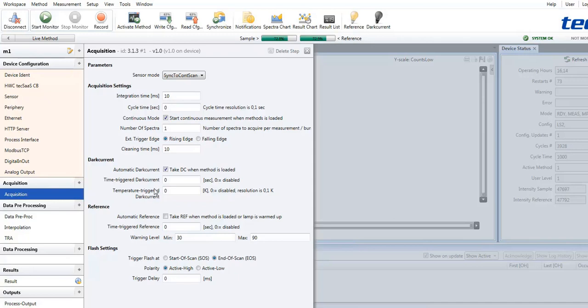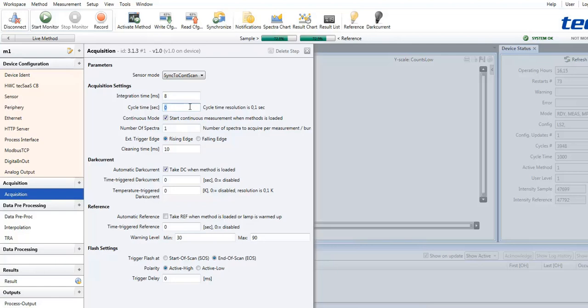Of course, for example, I am changing the value of the integration time. And the new value is then stored to the current method.